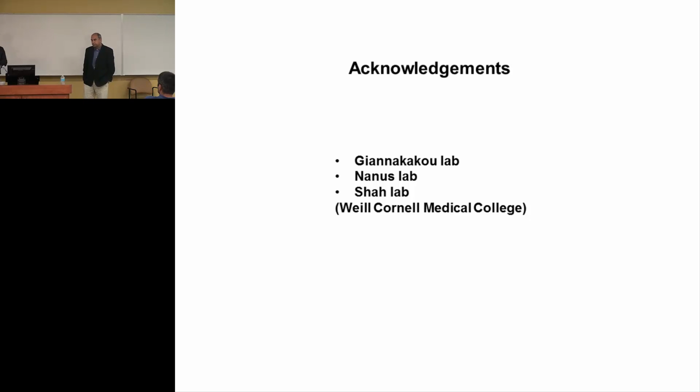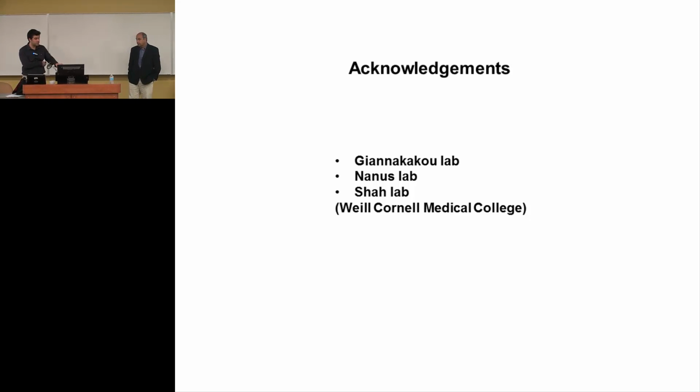I don't remember off the top of my head exactly. We have a little bit of a problem with the sampling because there is bleaching. Basically, the more often you image an event, the less you can observe it, because the probes are fluorescent, so at some point they don't show light anymore. I think most of these images are taken every 5 seconds. If you have very fast events, of course you want to take an image every 1 or 2 seconds to facilitate the tracking, but then you cannot observe them for a very long time.